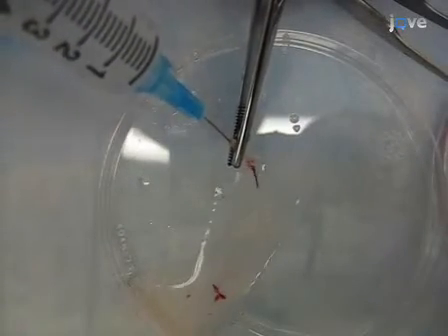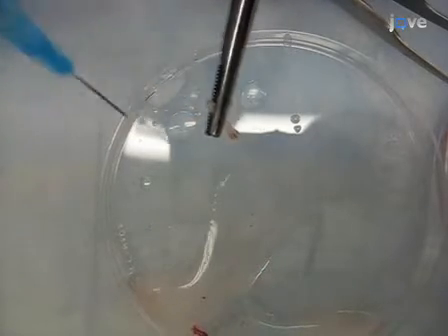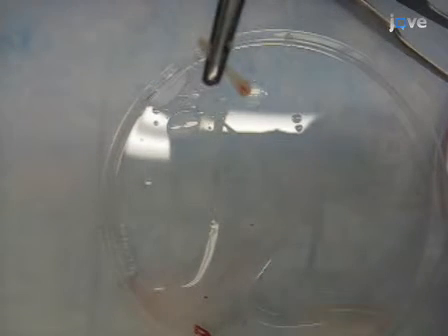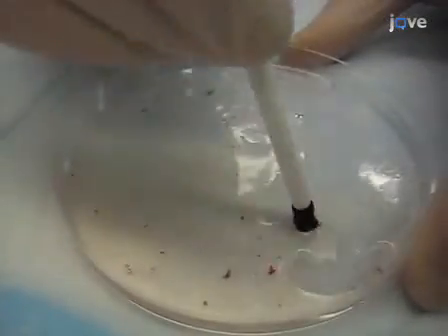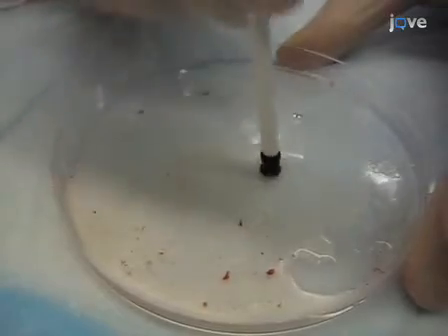Insert the tip of the needle into the center of the bone and push firmly on the syringe plunger to force the bone marrow into a clean dish. Continue until you can see that the marrow has been completely flushed and repeat this with the remaining bones. Using the rubber end of a plunger from a one ml syringe, gently dissociate the bone marrow into a single cell suspension by mashing with an up and down motion.